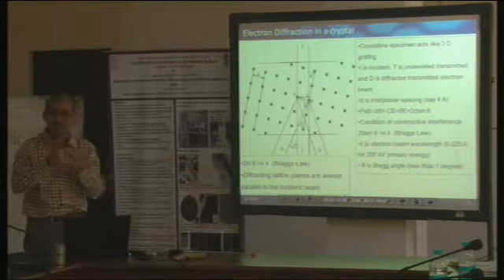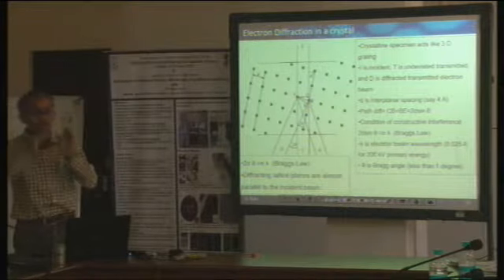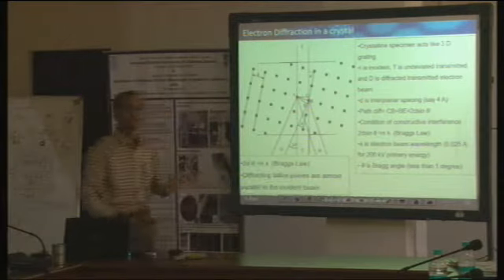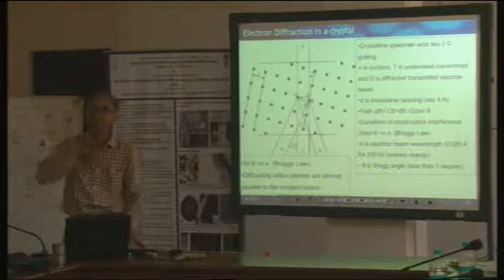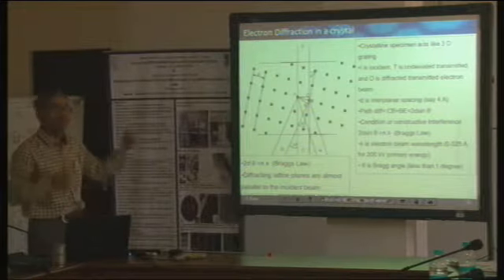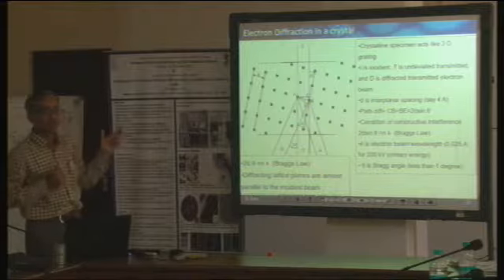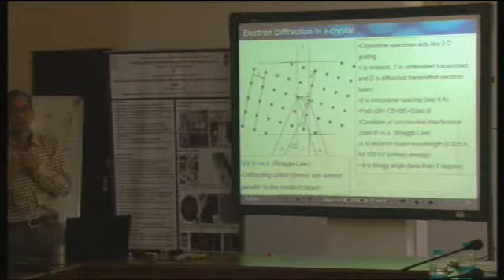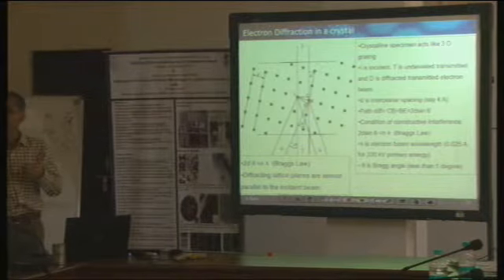So Bragg's law is working here, and we don't even go above 1 degree, let us say. Everything is happening in less than 1 degree. And that's where the uniqueness of electron microscopy or diffraction contrast microscopy for studying defects lies.